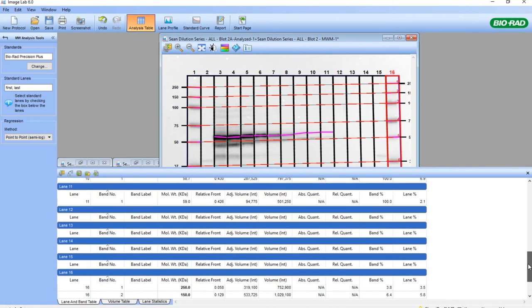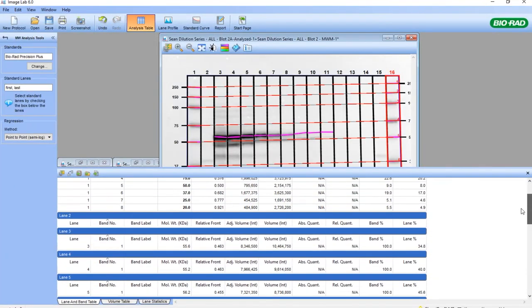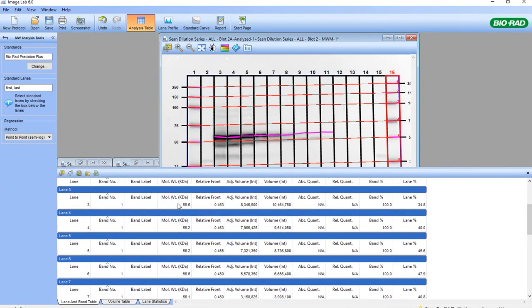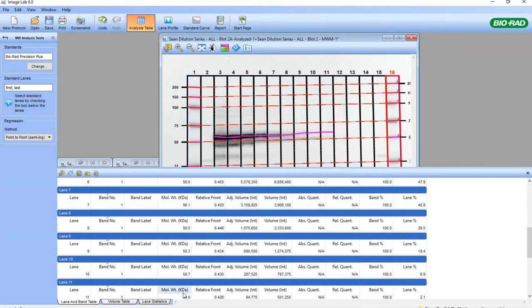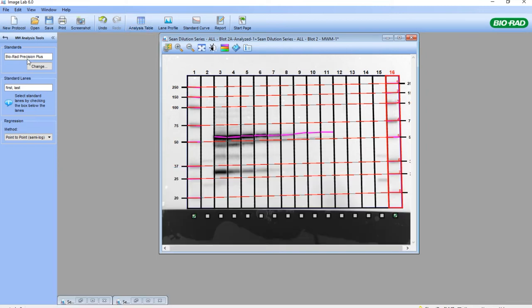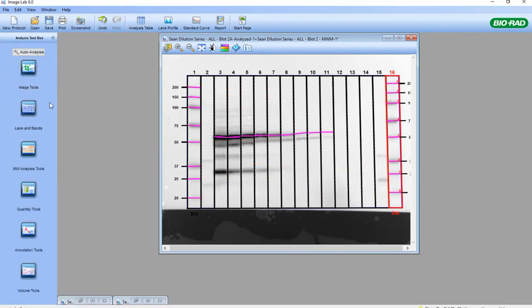The molecular weight of the individual bands starting in lane three are all very similar, because we were able to angle the markers based on the two lanes loaded with the same marker. Now let's move on to the next tool, which is the quantity tools.